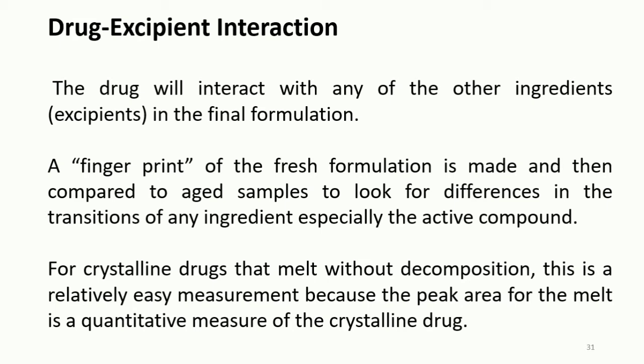Just as with many of the previous examples, always start the analysis of new materials with thermogravimetric analysis, TGA. This will save a lot of time in the end and definitely help to provide the correct interpretation of many transitions.